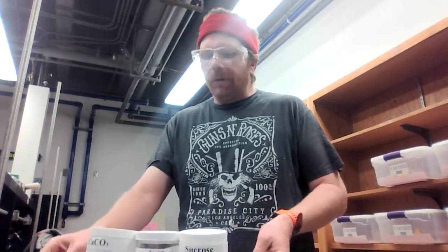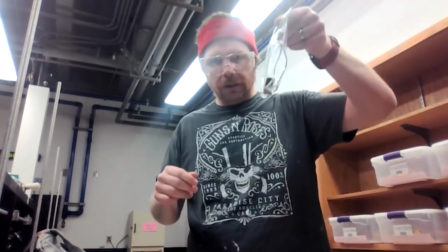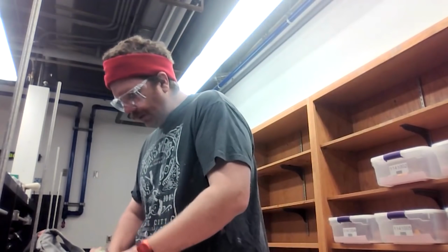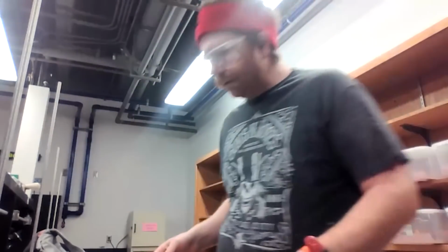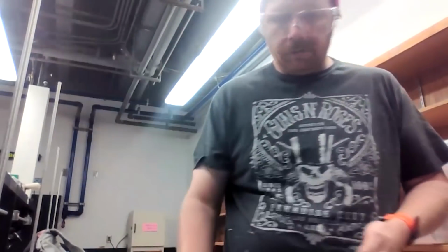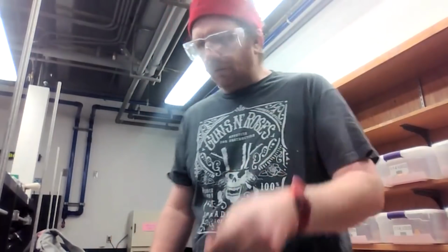But the way that we're going to be evaluating them is whether or not they conduct electricity. And the way that we're going to be doing that is with this setup right here. Now, what I have is a 9-volt battery. This 9-volt battery has a positive terminal and a negative terminal. I've also got this little strand of lights, these two lights, and I've got a piece of wire.